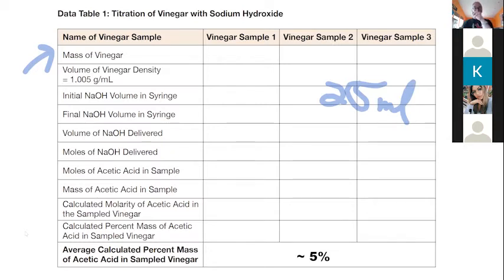We'll put sodium hydroxide of a known concentration in a syringe, and we'll add it by half mils at a time, with swirling. You'll notice it'll change pink. You get a little bit of pink color. And then when you swirl it, it'll go away.